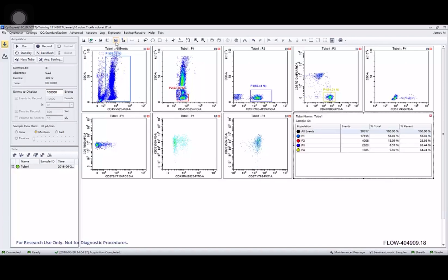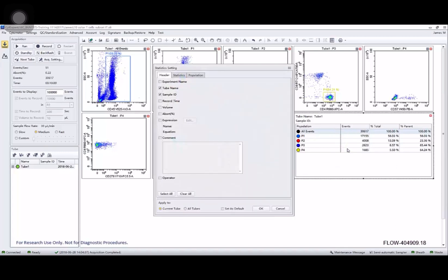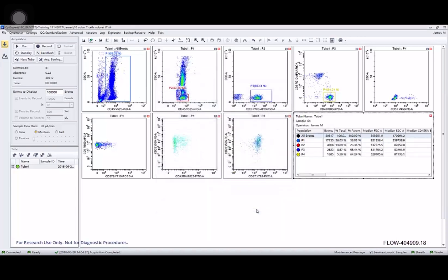If I wanted to create some statistics, I can click the statistics button. I get some options to export as well as to be able to change what statistics are displayed. So I'm going to add who the operator is, have that display for all tubes, and then maybe I also want median values for all channels for each of the gates. And now I get that data.